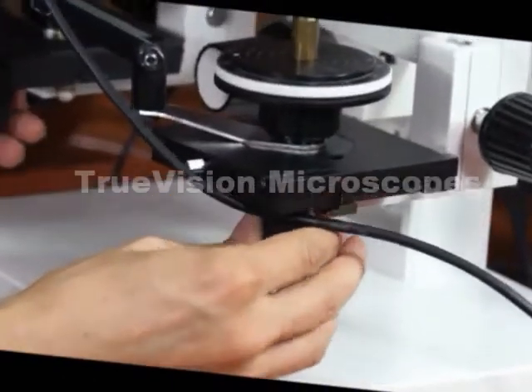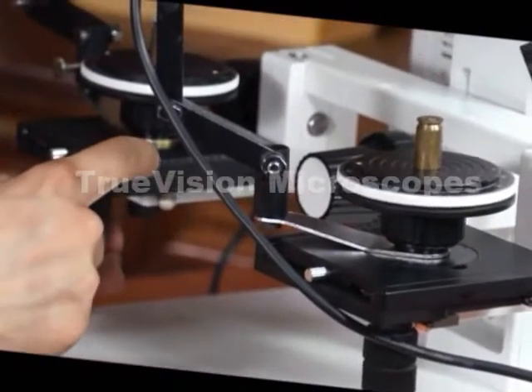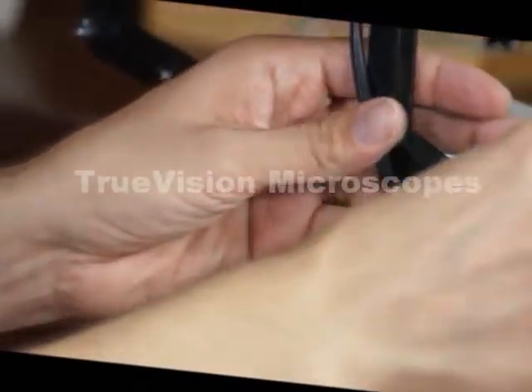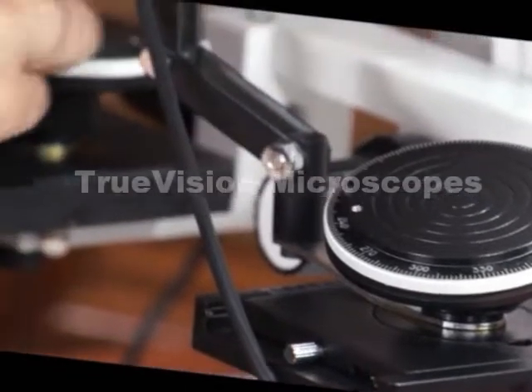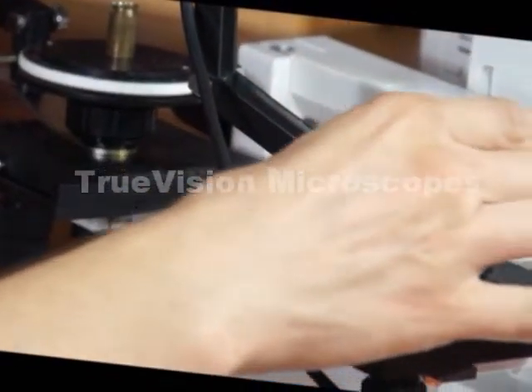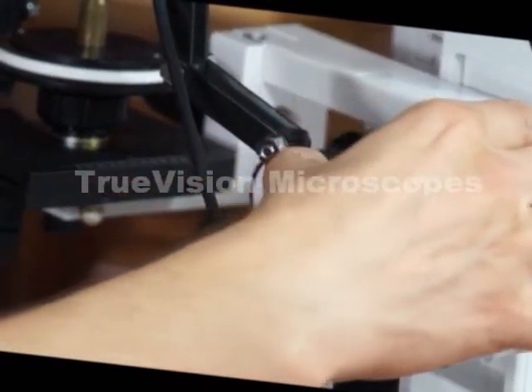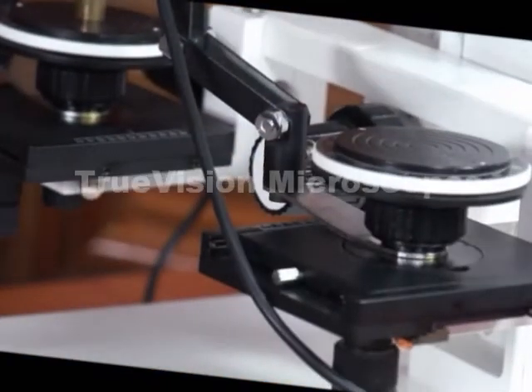These stages move in the X and Y direction and also have readouts — this particular one reads 0 to 50 millimeters. They are also tiltable stages that can be removed with this knob. The stages are 360-degree rotatable with a marking for every degree.